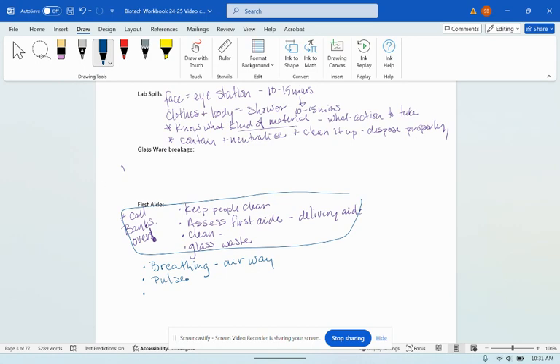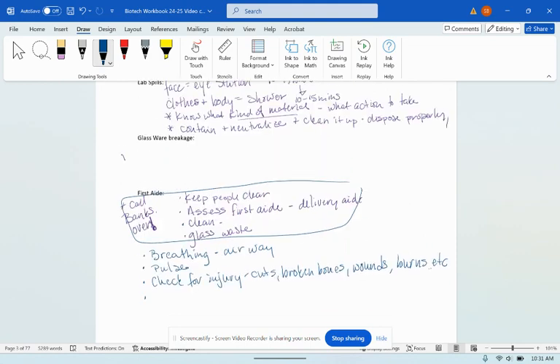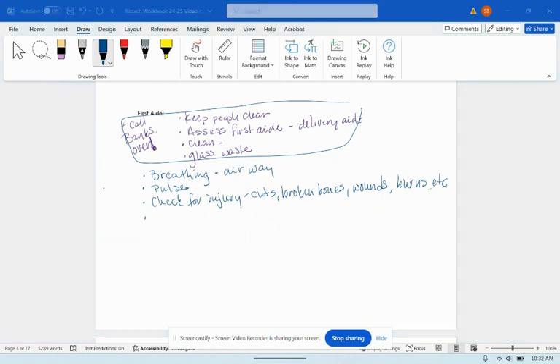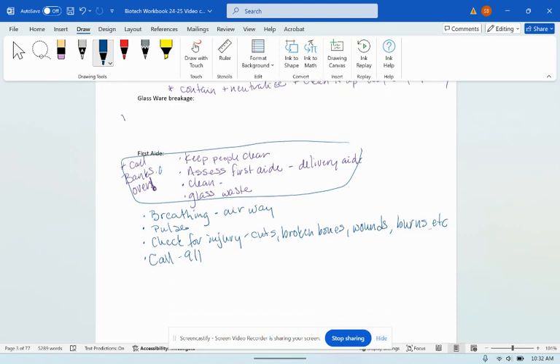Next thing we're going to do is we're going to check for injury. So that could be cuts, broken bones, wounds, burns. We're going to check for all kinds of injuries, okay? And then once we have done an assessment and checked for those kinds of injuries, we are going to use the appropriate first aid. Okay? At that point, we should have somebody call 911 and we should administer first aid.